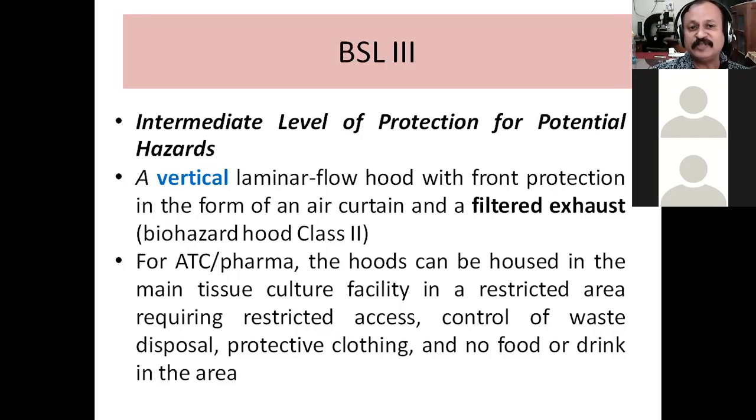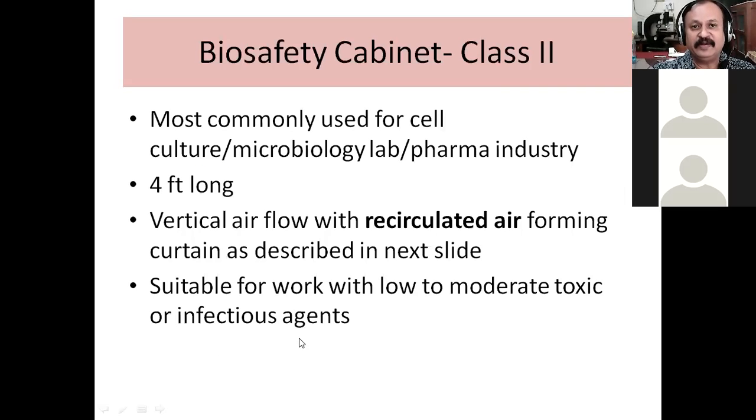No unauthorized persons will be allowed to enter that area, and only authorized persons will carry out work in that facility and in that cabinet. Like before, control of waste disposal is there, protective clothing is essential, and there is no eating and no drinking in that area.